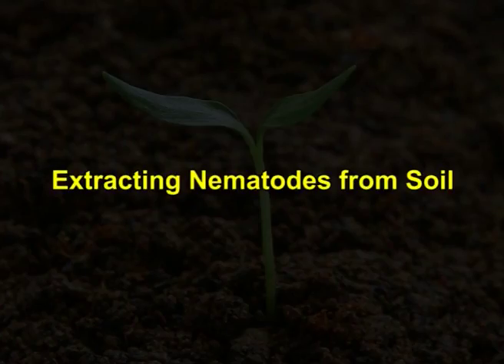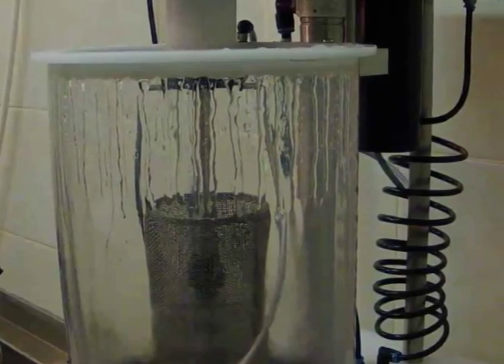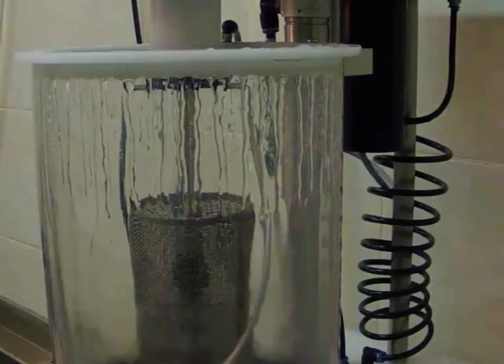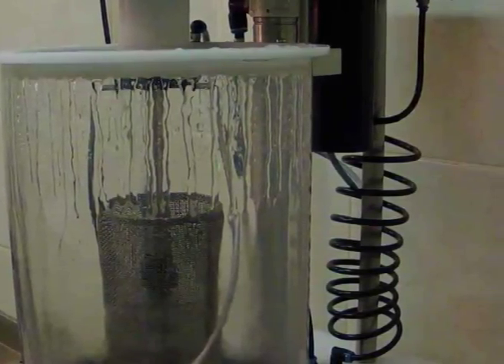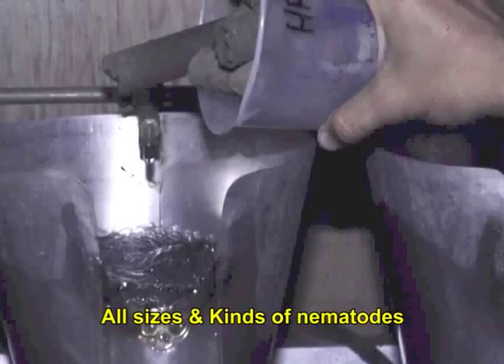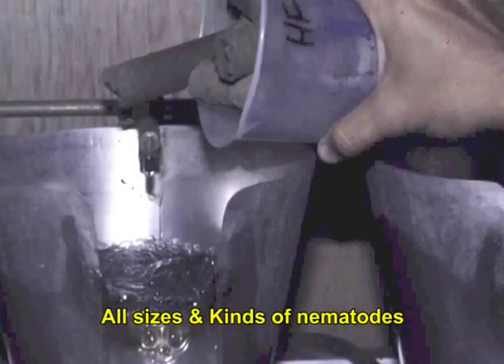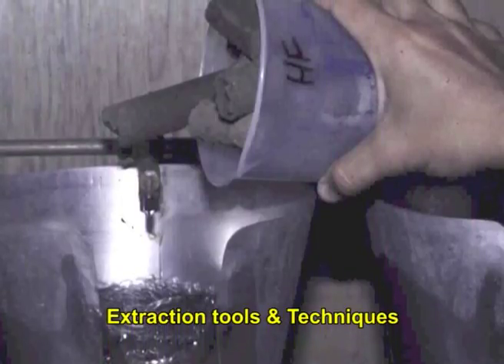Extracting nematodes from soil. Plant parasitic nematodes may be extracted from soil and infected plant materials in many different ways. No single technique will efficiently extract all sizes and kinds of nematodes, and therefore an endless range of extraction tools and techniques have been developed for extraction of nematodes.